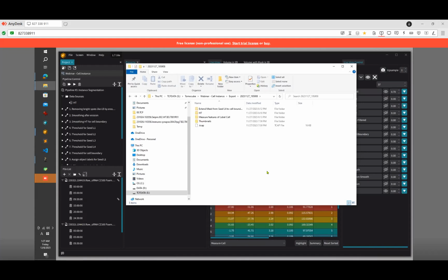And the tracking is quite tricky because, you know, the cells divide and sometimes die or go out of focus. So we should take into account all these things together, and that's quite a tedious job to make it perfect. So that's why we are not focusing on the tracking feature at the moment. So bear with us for that.